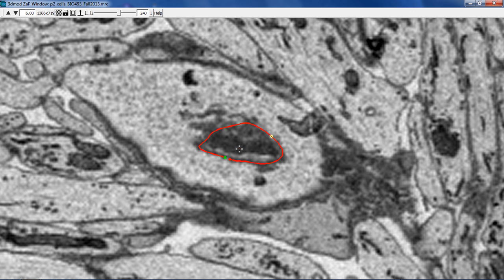We can actually hit that a few times, but as you'll see, we're losing resolution on our trace. So you want to be kind of sparing with that. Let's say I don't like how this turned out. We can hit Control Z to undo. Actually do that a few times until we get back to something that we like. If we want to redo it, you can just hit E and R again. Let's say I don't like what it did here.